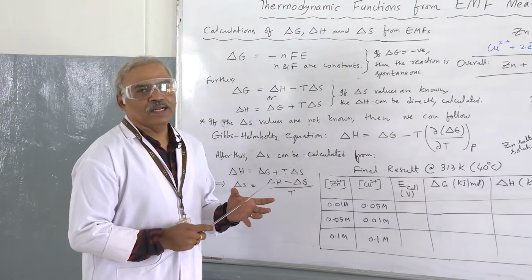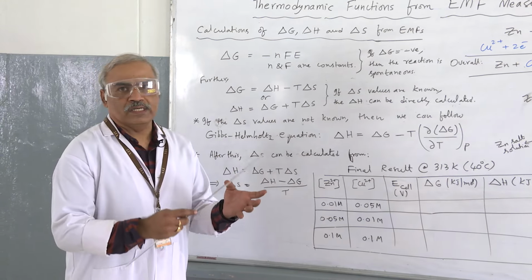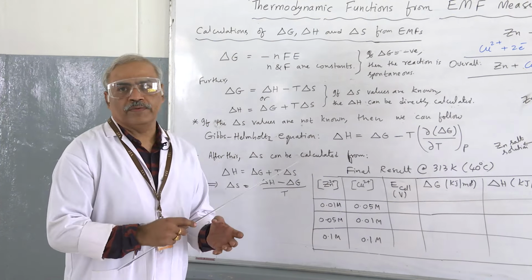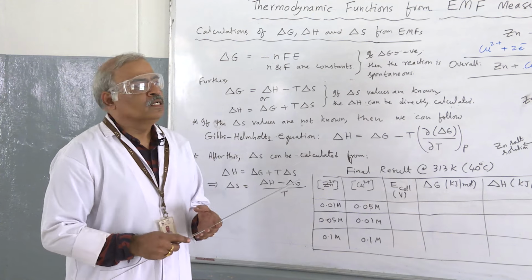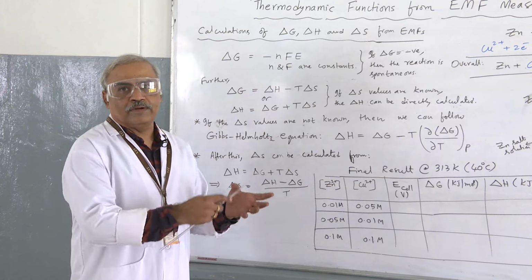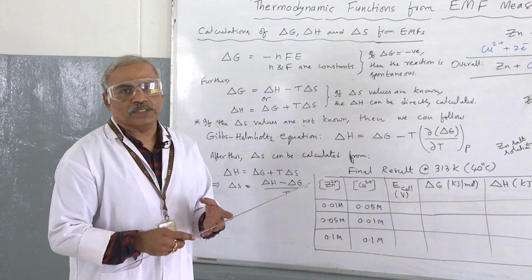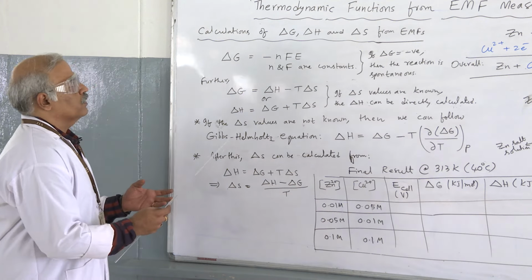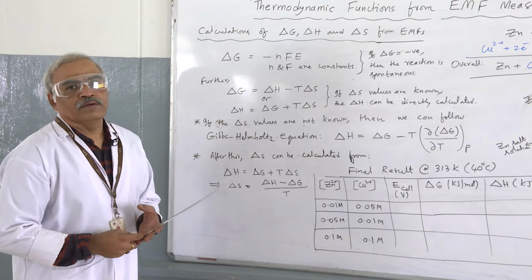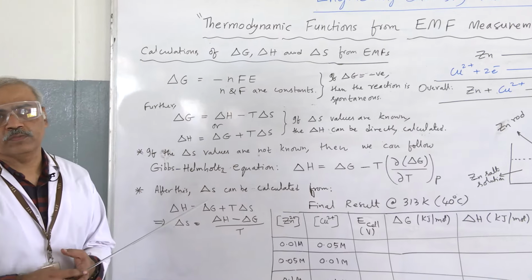In this Daniell cell, we are going to immerse the zinc electrode in zinc salt solution and the copper metal in copper salt solution, and thereby record the EMF value. This is an experimental value. Then we are going to calculate the E cell value through the Nernst equation. From the values that we obtain, we are going to calculate the change in free energy, the change in enthalpy and then the change in entropy.